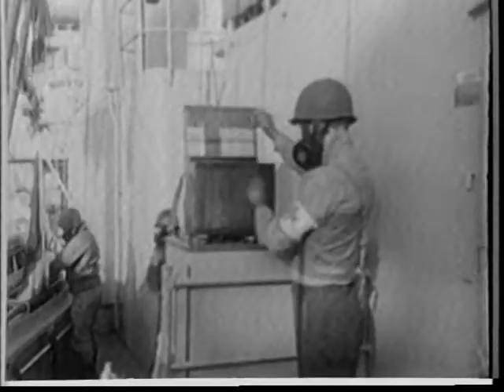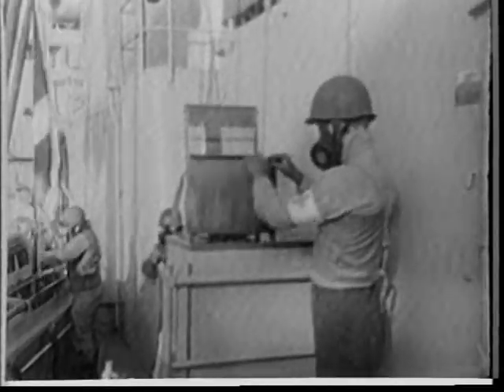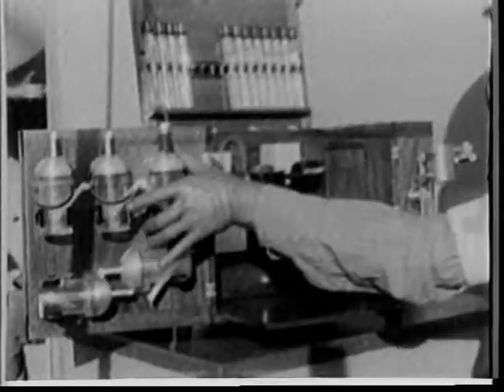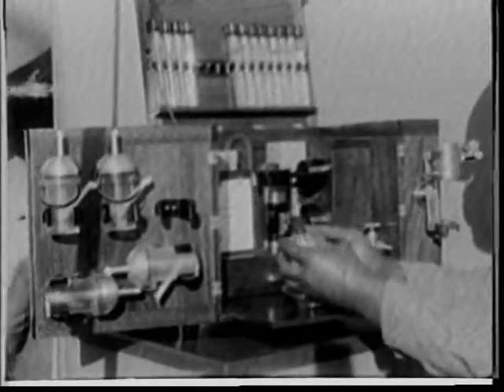If the ship is warned of an attack in advance, damage control personnel will be able to collect samples of the BW agents the enemy was using. This is an air sampling kit.